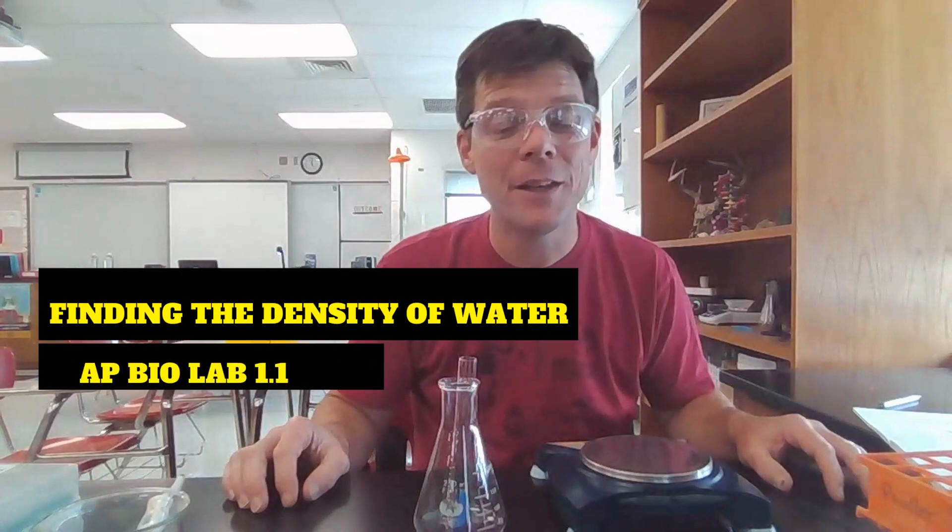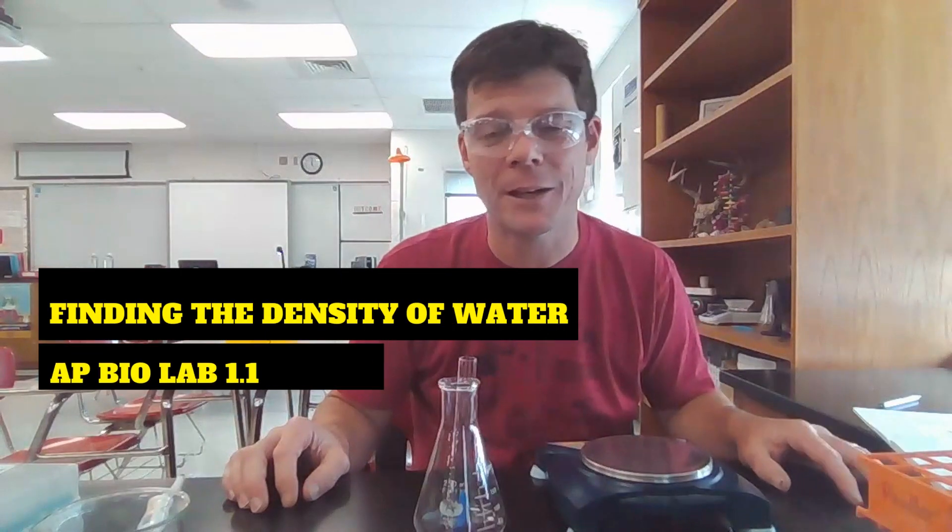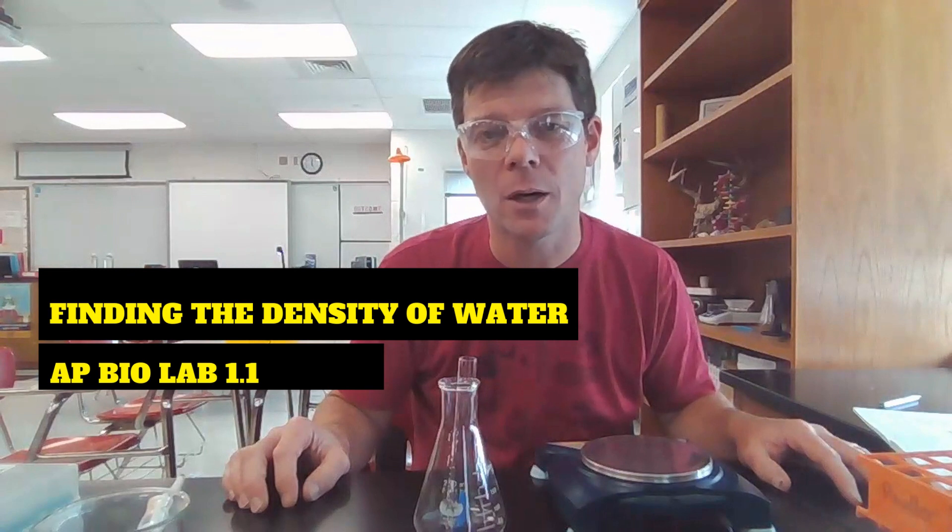Hey, biology friends. It's Mr. Pauler. In this video, we're going to be performing an experiment to determine the density of water and also learning how to use a tool called a micropipette.